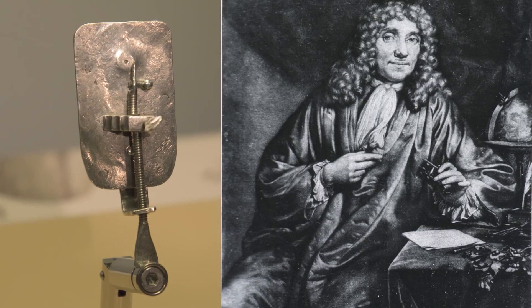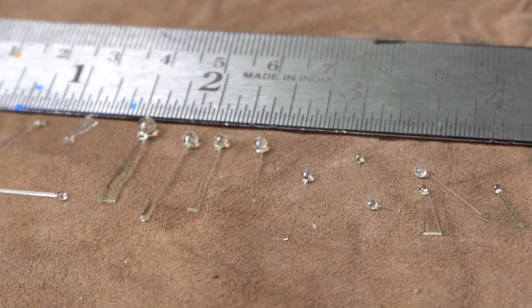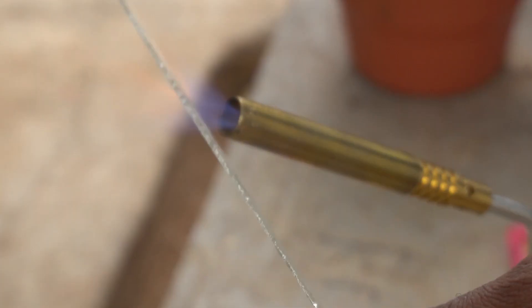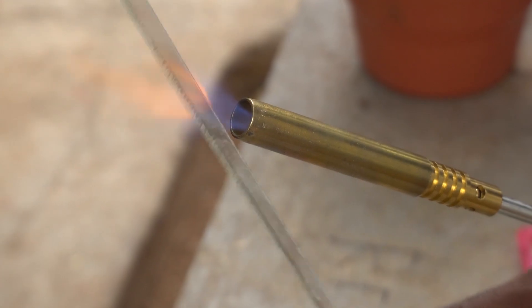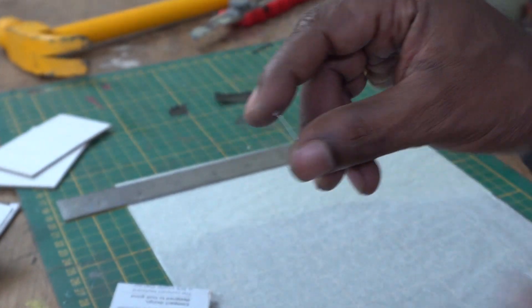Hi guys, this video is a take off from my previous video where I made a microscope using the designs of Anton Leeuwenhoek, the father of microbiology himself. It required me to make glass beads of 1 mm in diameter which I made myself by melting glass. It was a fantastic educational DIY video and if you have not seen it already, please do check it out from the description below. It turned out to be a lot better than the usual DIY microscopes that are made with laser pointer lenses.